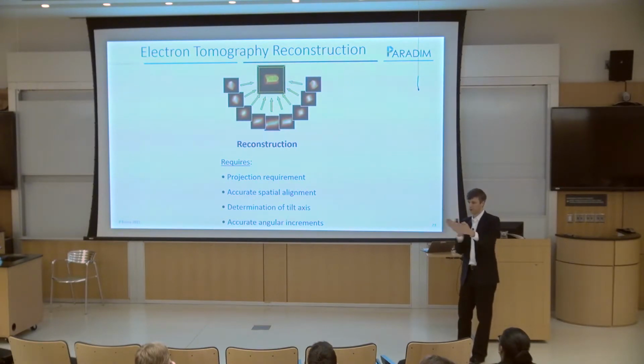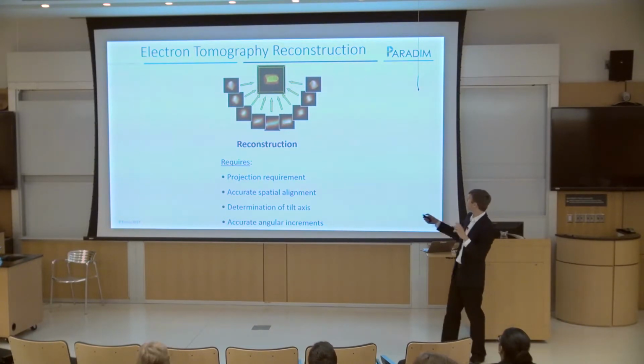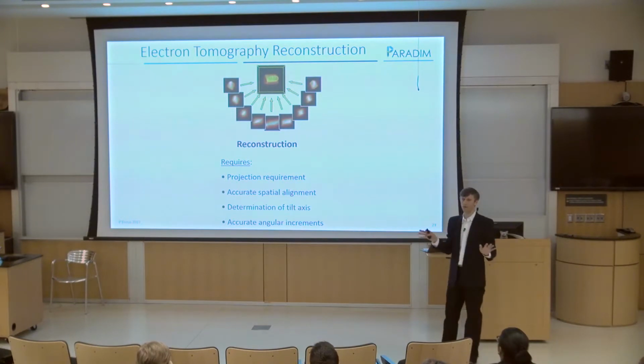It doesn't have to be orthogonal. You can look at all kinds of weird directions. Okay? And the computer, the way that this operation works, you don't have to see a specific thing or be able to see it in a certain projection image. Like you don't have to see a certain lattice spacing in a projection image or a certain shape of a certain object in a projection image. Or if 2 objects overlap each other, you don't have to get it such that they don't overlap. You just don't have to worry about that. The reconstruction algorithm will take care of all of that.